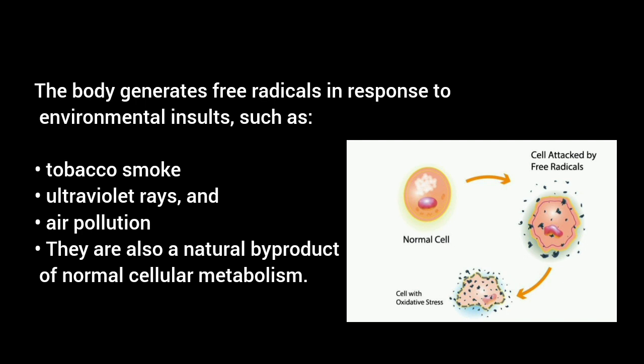They're so desperate. All they want is to grab an electron from somewhere so that the sad, lonely electron that's sitting there in their outermost orbital can find its pair. And then there are atoms and molecules that our cells are made of. They are living their peaceful and purposeful life, trying their best to keep us alive. So what these restless free radicals do is that they go and poke them.